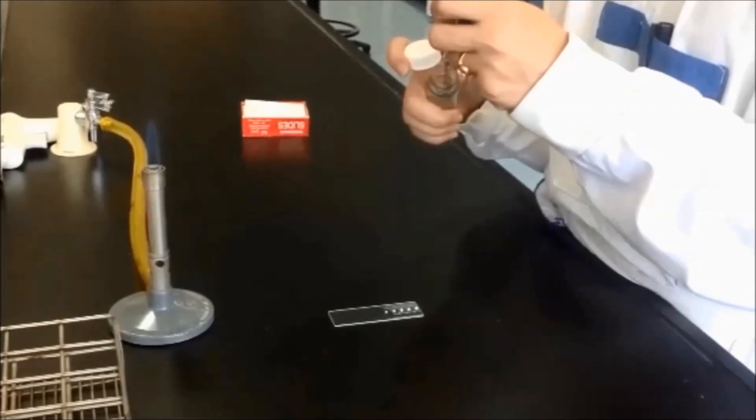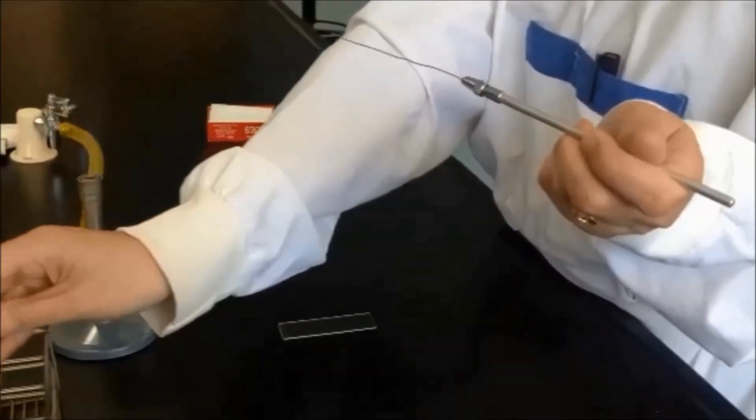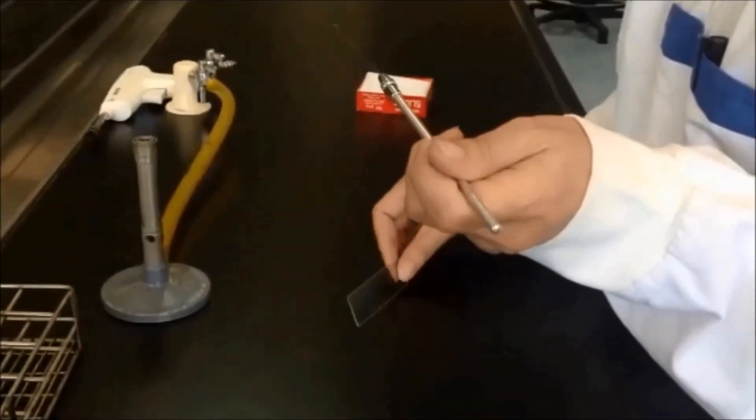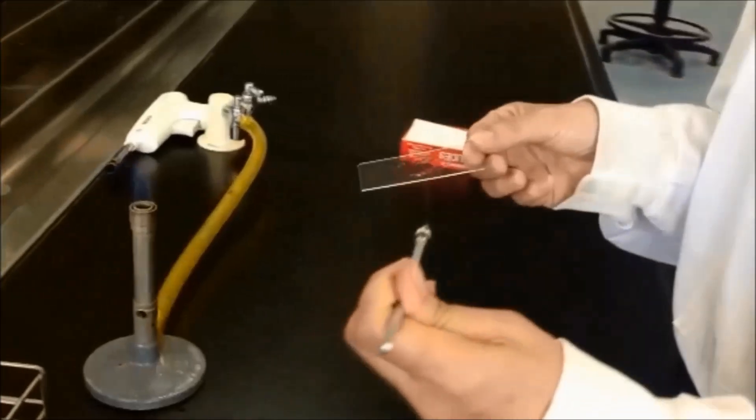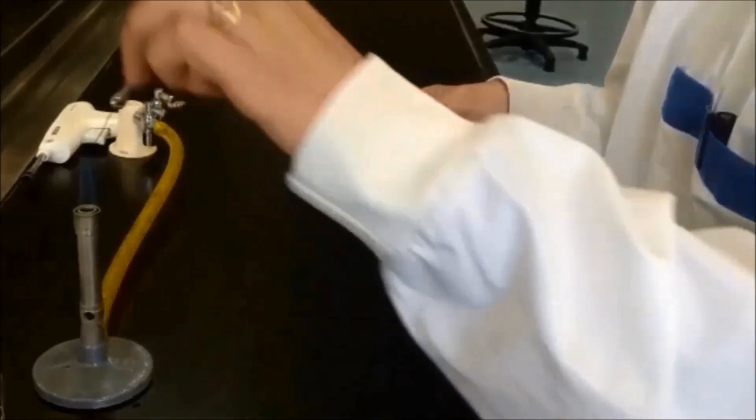Once the loop has cooled down, take a loopful of the broth culture, then spread it thinly onto the surface of the slide. Re-sterilize the loop.